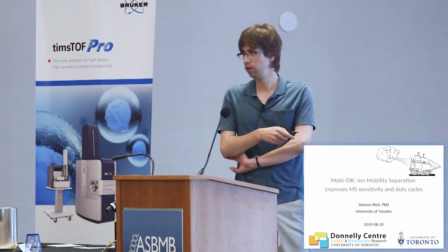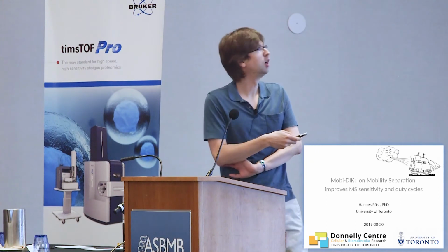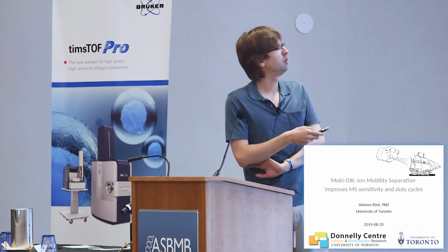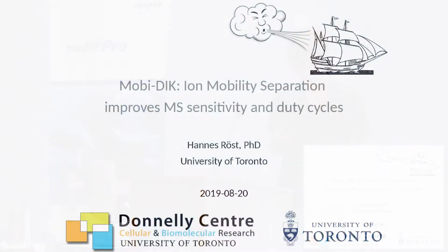So today I will talk about the development of our software platform called MobiDIK, which stands for Ion Mobility DIA Analysis Toolkit, where we use ion mobility to improve MS sensitivity and duty cycle in DIA SWATH type of data.